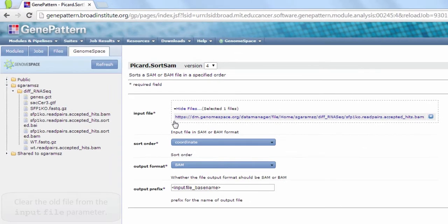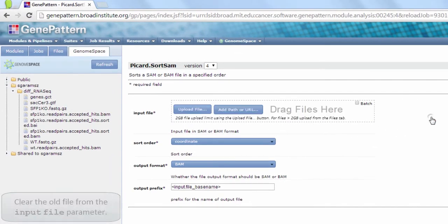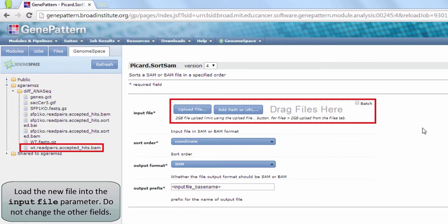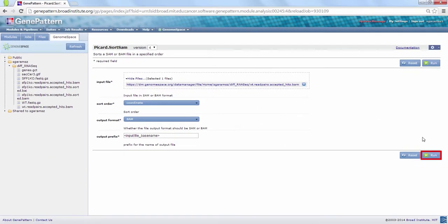Delete the old mutant file by clicking on the X on the right. Click and drag to load the wildtype Accepted Hits BAM file as our input. Run the job.